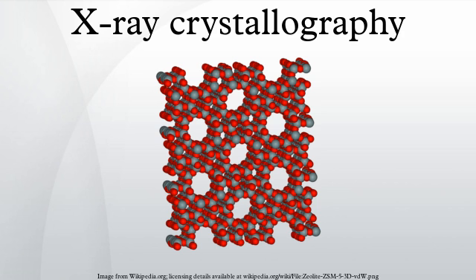X-ray sources. The mounted crystal is then irradiated with a beam of monochromatic X-rays. The brightest and most useful X-ray sources are synchrotrons. Their much higher luminosity allows for better resolution. They also make it convenient to tune the wavelength of the radiation, which is useful for multi-wavelength anomalous dispersion phasing, described below. Synchrotrons are generally national facilities, each with several dedicated beamlines where data is collected around the clock, 7 days a week. Smaller X-ray generators are often used in laboratories to check the quality of crystals before bringing them to a synchrotron and sometimes to solve a crystal structure.